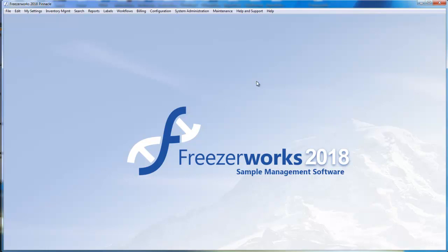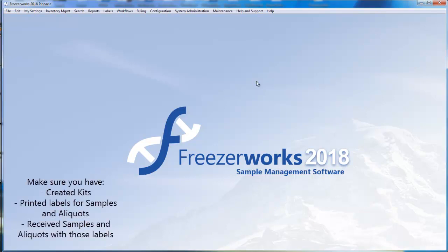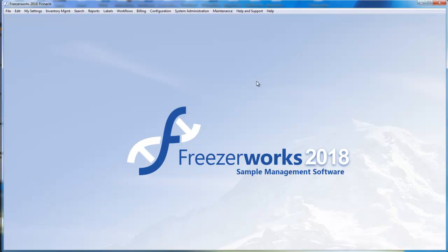Last time we finally received some data for our study and entered it into Freezerworks through the form of visit kits. But what if instead of getting whole kits from our clinic, we received collections of loose samples or aliquots for a number of participants and a variety of visits? Well, the process remains largely the same. If the data is pre-generated, and the samples or aliquots all still have the labels we printed when creating kits, we can get to scanning.